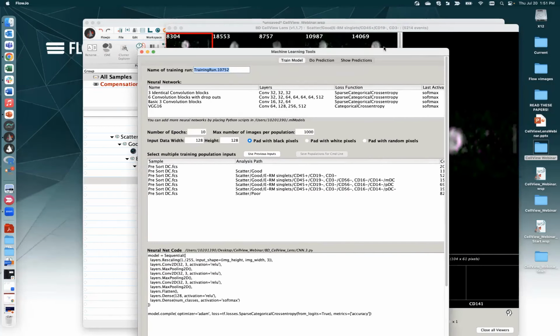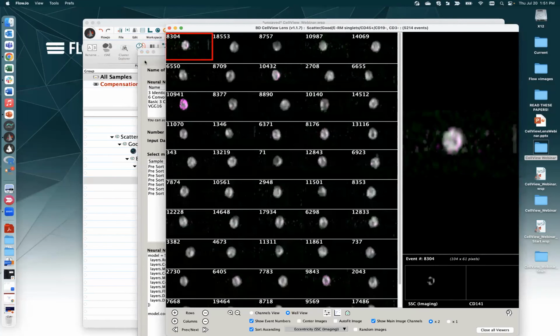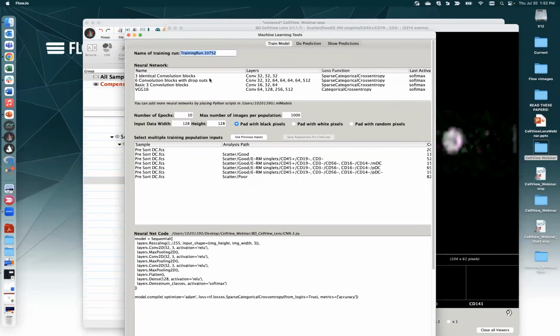So the things that we're trying to do. Oops, sorry, sent it to the background. We can add a variety of neural networks. Neural networks are essentially some kind of algorithm that takes the measures you feed to it as inputs, and it passes them basically through a series of weights and says, all right, if we pass the series of weights and we get one number, you're this type of cell, or this class of data. And if you pass through the weights and you get another one, then you're a different kind. So we're generally trying to separate two things from each other.